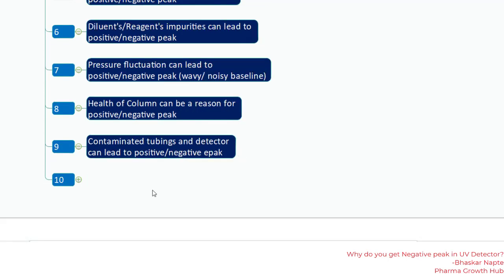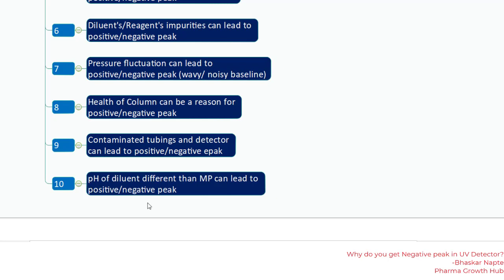Contaminated tubing and detector can also lead to positive or negative peaks. Similarly, a diluent pH different from the mobile phase pH can cause positive or negative peaks. If the diluent pH decreases the absorptivity of your sample constituent, you will see negative peaks; if it increases the absorptivity, you will see positive peaks coming out of your chromatographic run.